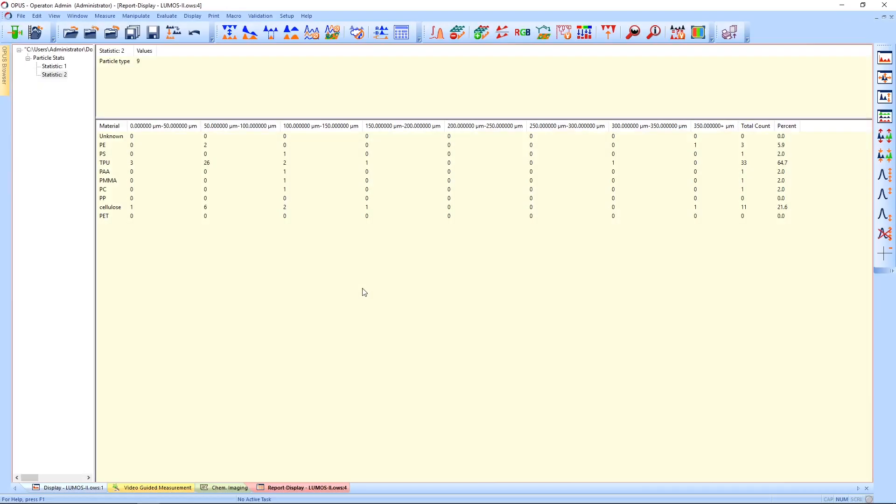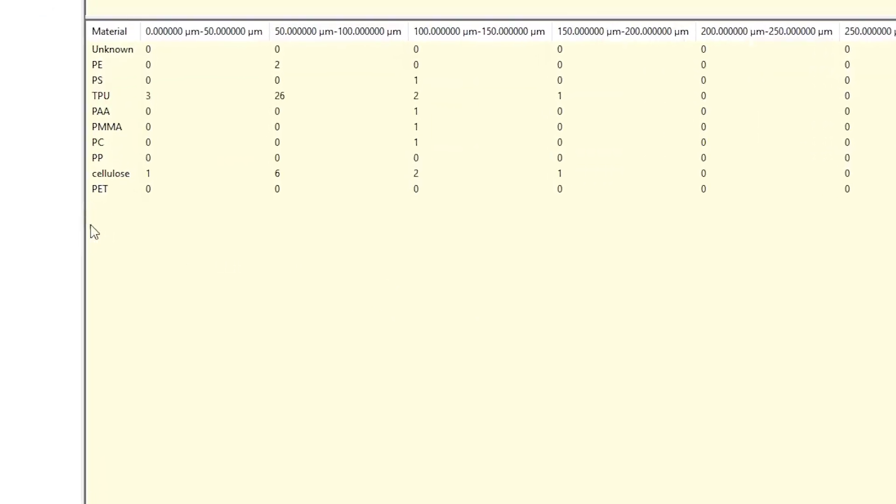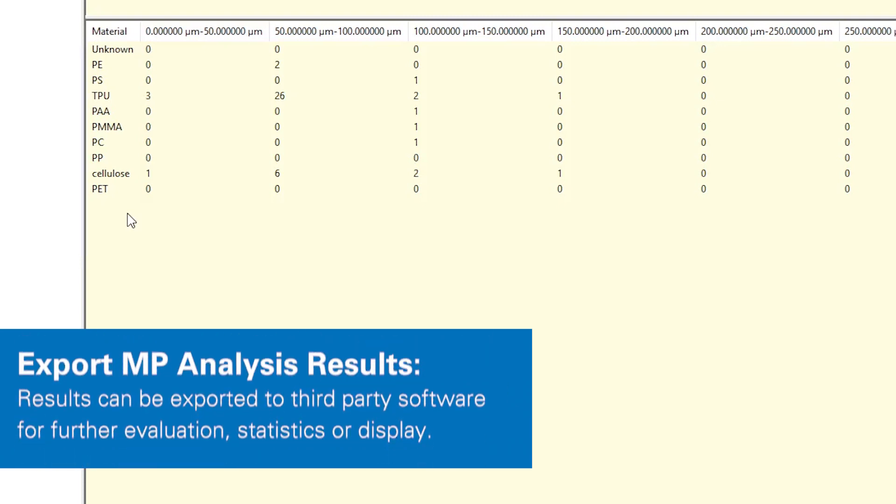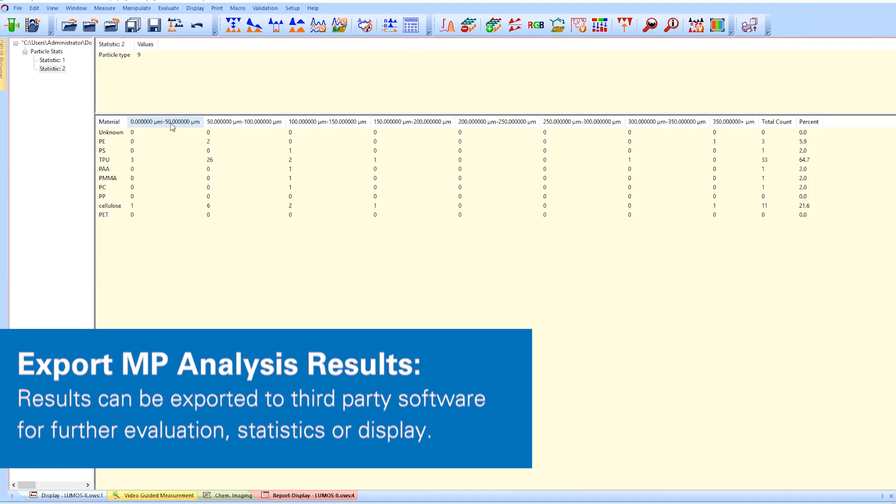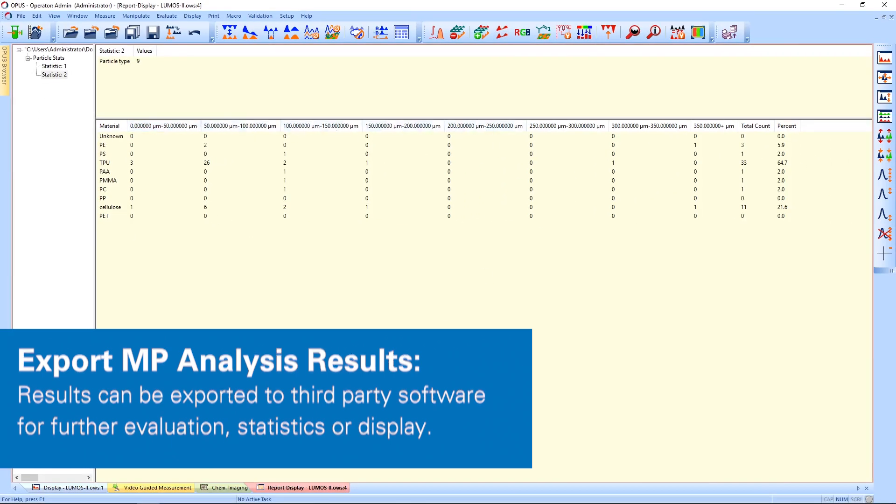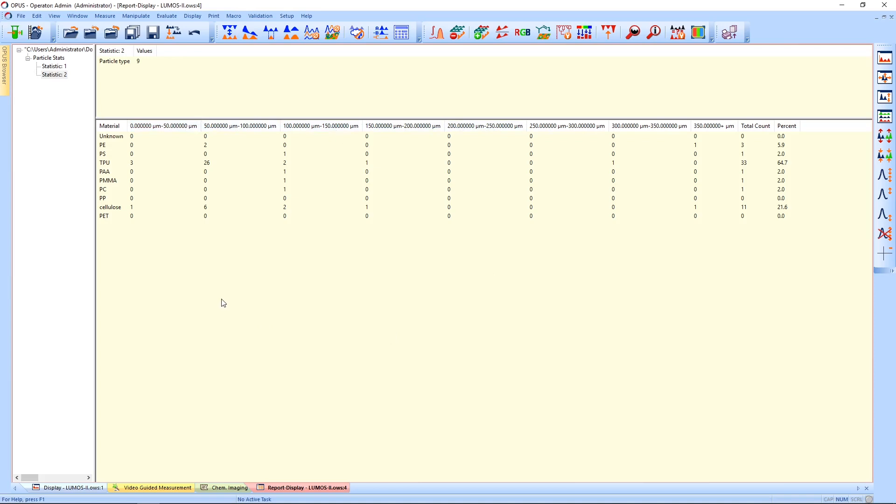The result of the analysis is shown in the report window. In the first column, you have an overview over the material that is included in the method. This is just a small example and you can add as many materials as you like. On the top row, you see the size distribution and for this sample, you can see that most particles are smaller than 100 micrometers and are identified as polyurethane.